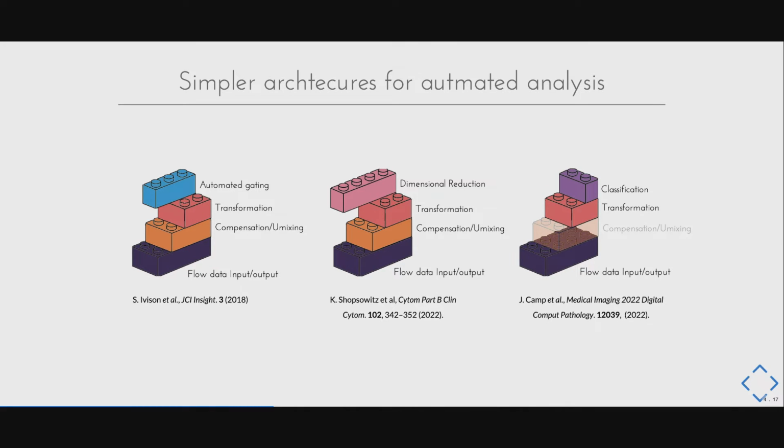However, simplicity does not necessarily mean the system performance is not as good. There's a recent study put out from Mayo Clinic that highlights the neural network classifier for uncompensated data. Eliminating this compensation would greatly simplify the workflow.